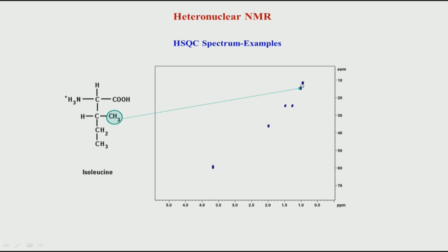Typically, we have to assign each and every peak to the respective pair based on more experiments. So, right now I am only showing you the results, given a spectrum, how the peaks look, but how we arrived at which peak is which is going to come later, where we look at more experiments.